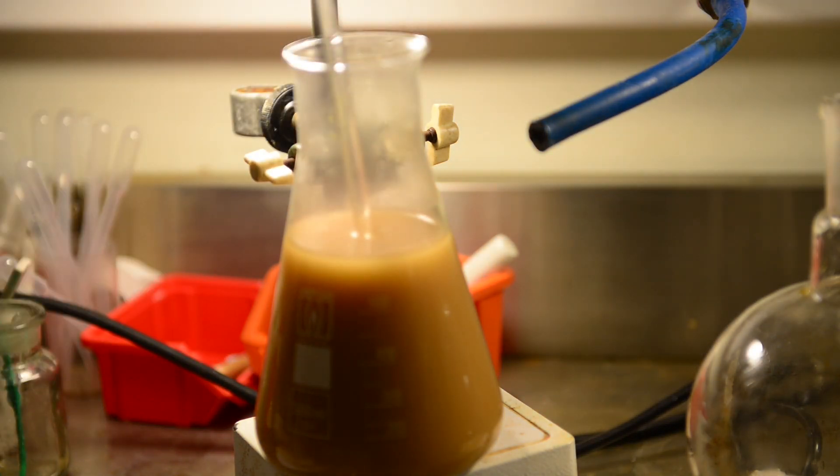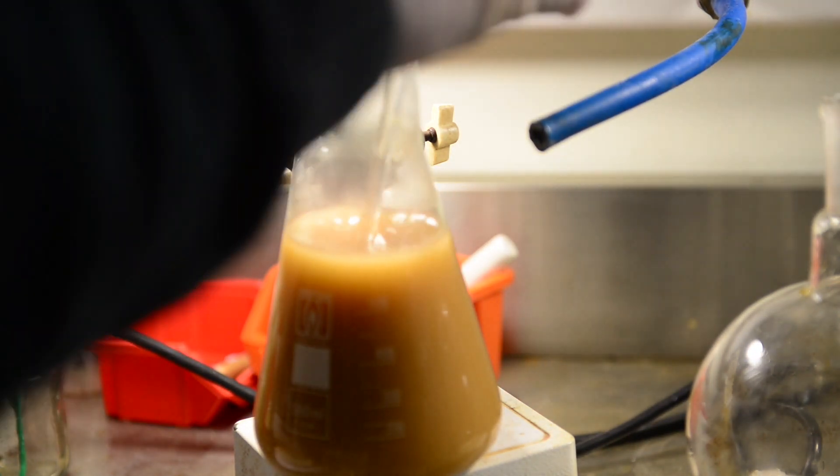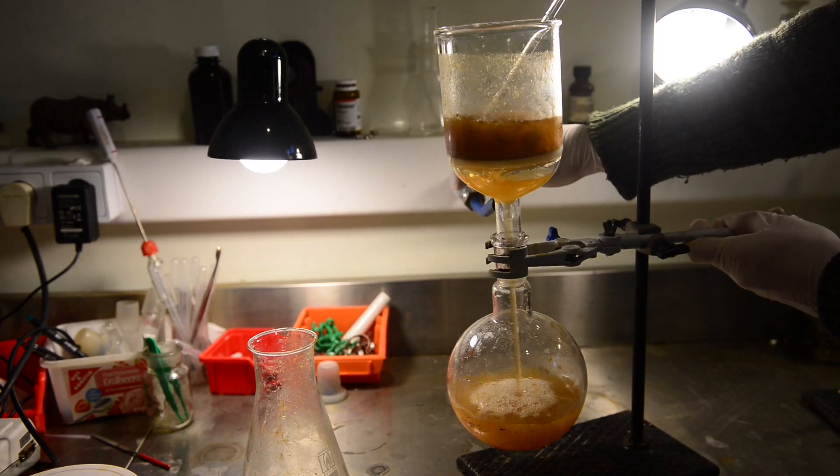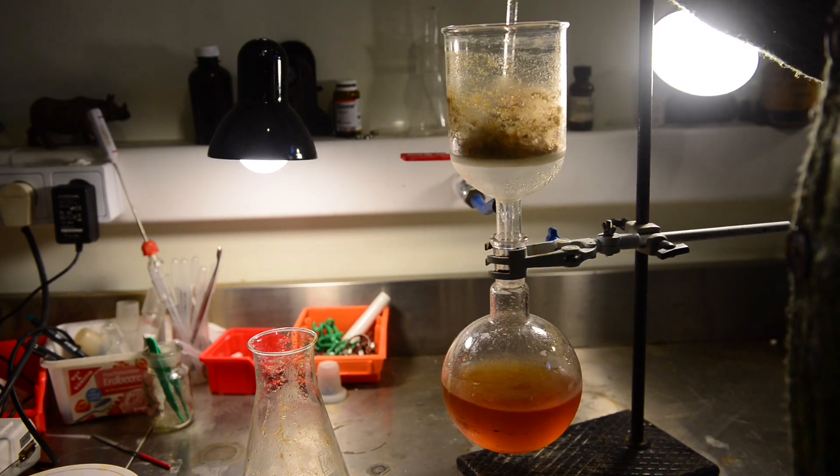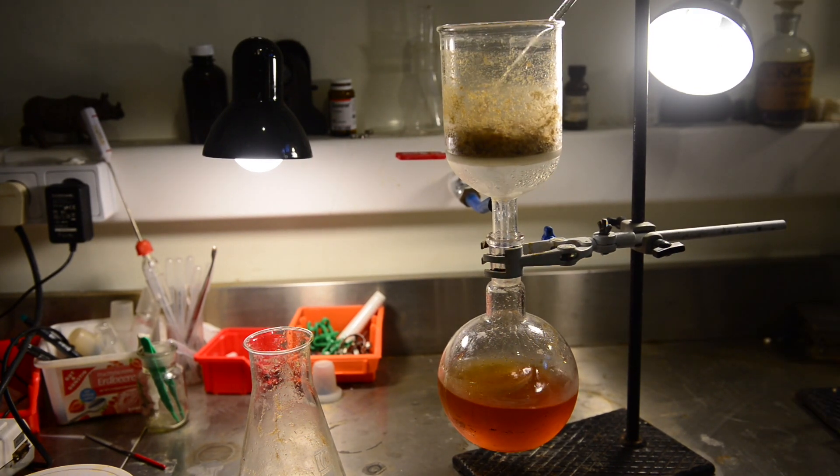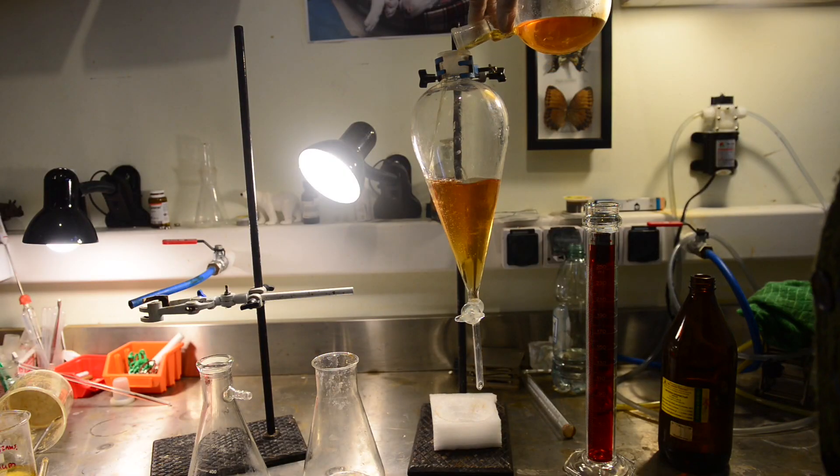On the next day the flask is full of nice yellow brownish crystals. I'm going to filter mother liquor with vacuum. Here we are left with crude protocatechuic aldehyde on the filter. I'm drying it for 15 minutes with vacuum running.